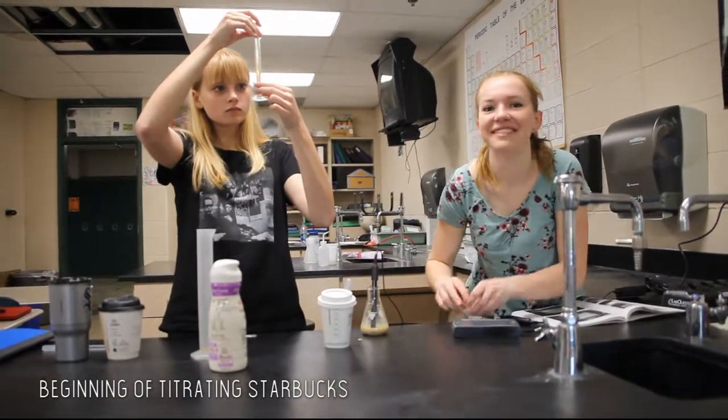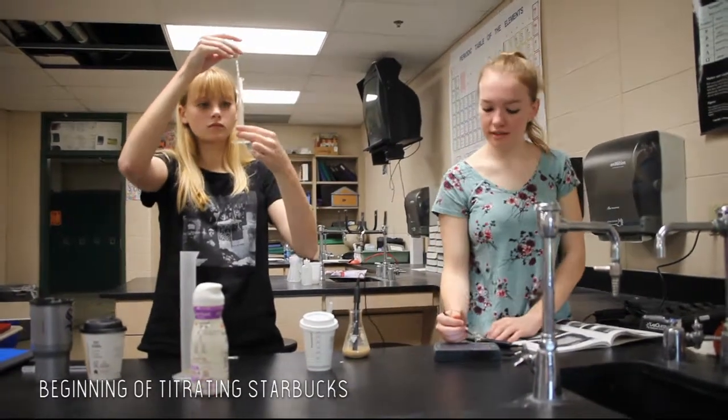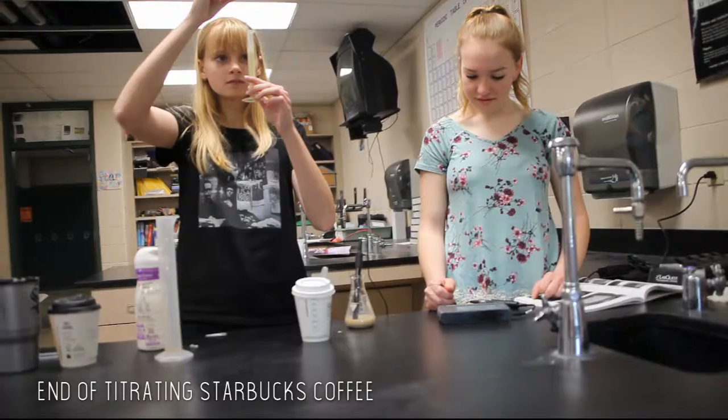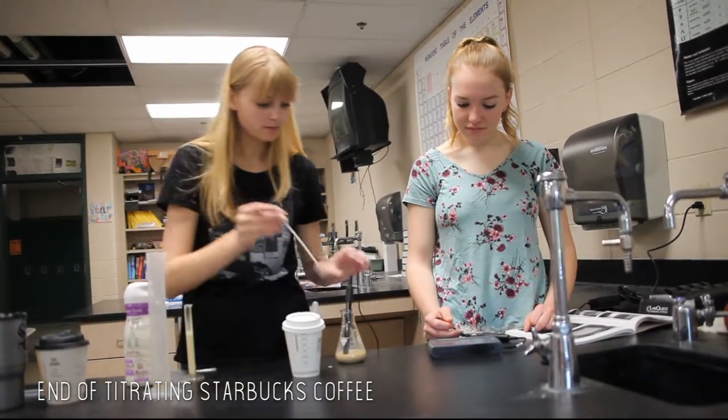This way, we could get multiple results from multiple trials for each brand of coffee that we used, and this could help counteract any little errors that occur from experiment to experiment. Additionally, it would also be nice to test other types of creamer other than the Coffee Mate Sweet Cream Creamer that we used in this particular experiment.